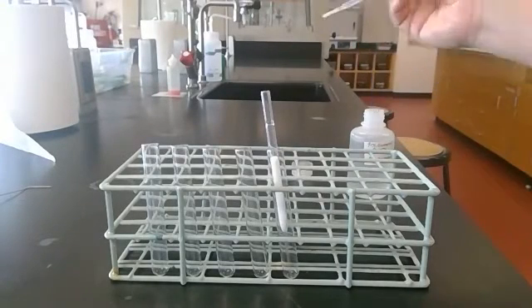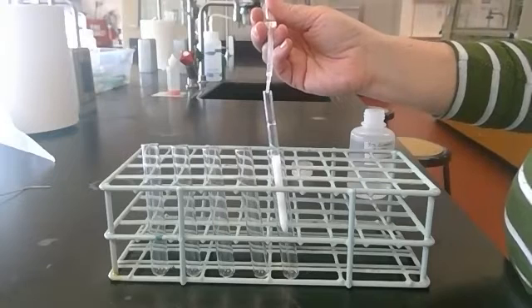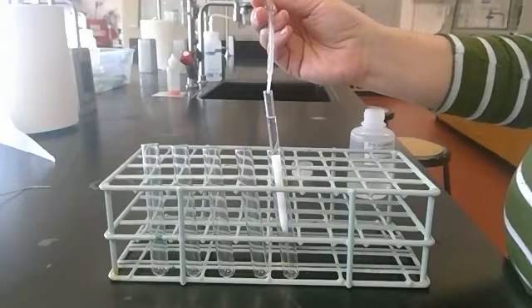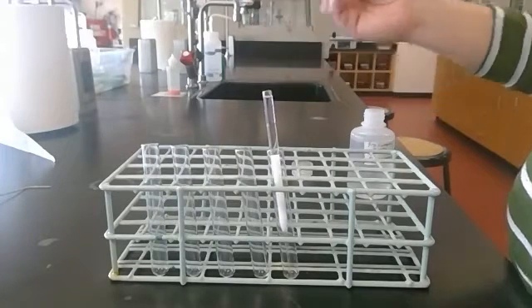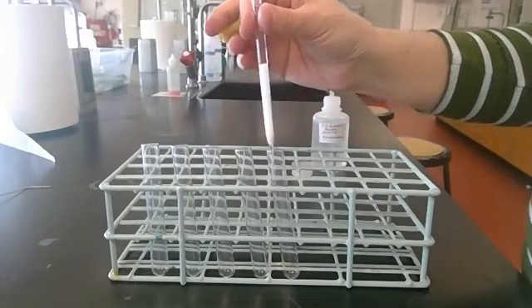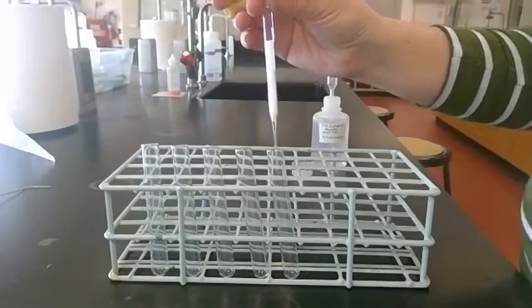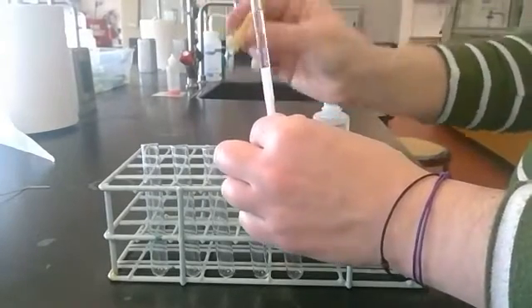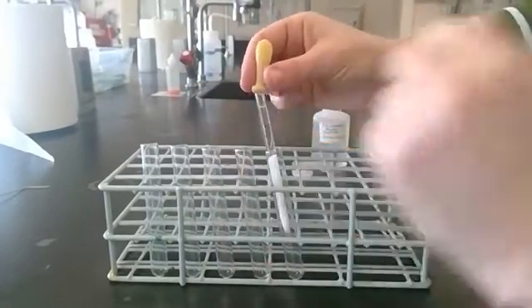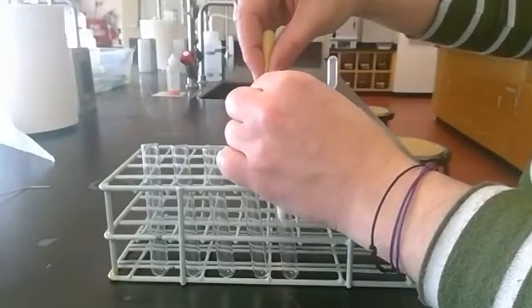So what I'm going to do is very carefully add my isopropanol kind of dropwise so it layers on top of the silica gel. And again, this is just preparing my column. I can let this move through the silica gel by gravity, which will kind of happen a little slowly, but not too terribly. And it'll slowly then drip out. I can also give this a little helping hand with a pipette bulb. Let me show you what this is going to look like right here. And what I'm going to do is just place it over the top very carefully and give it a little bit of pressure.